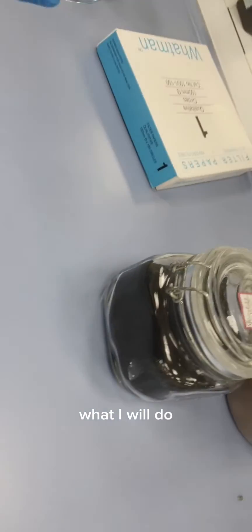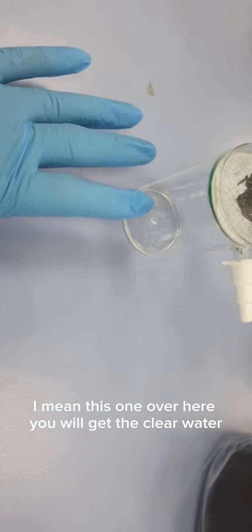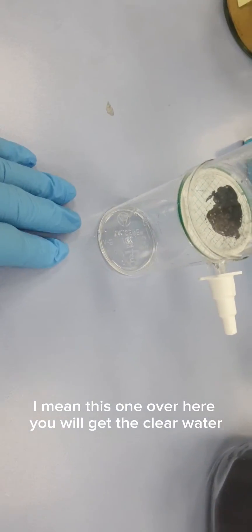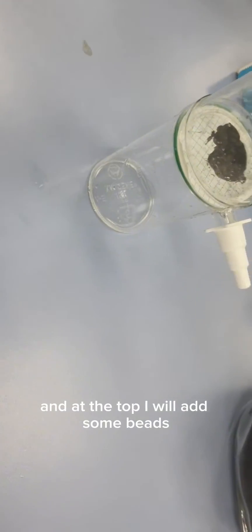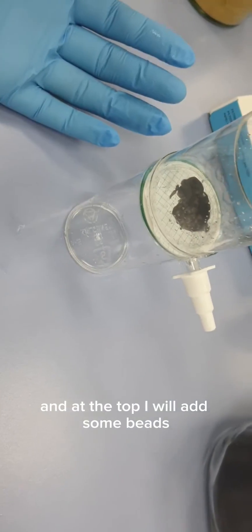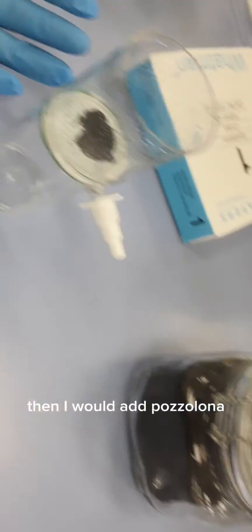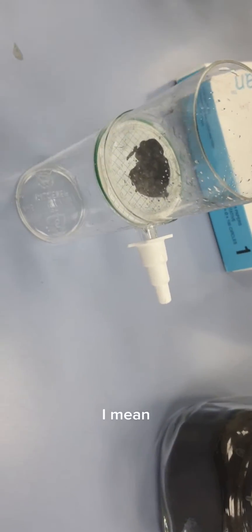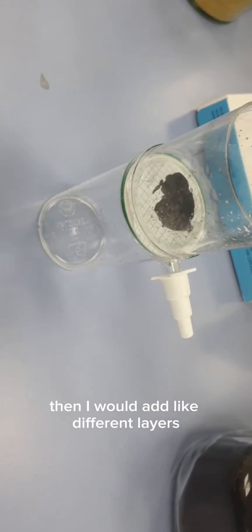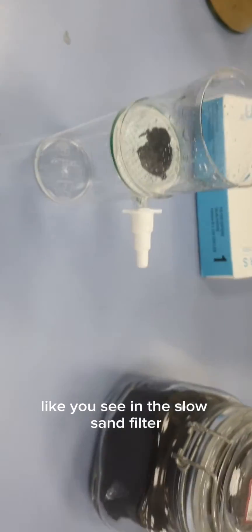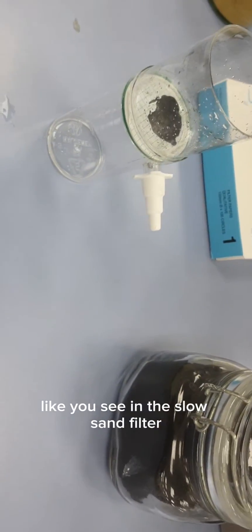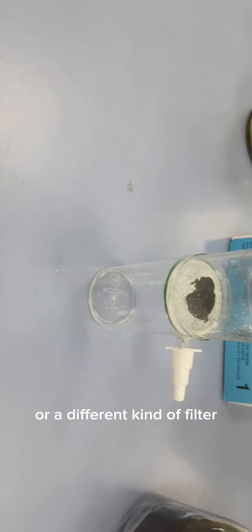At the top I will add some beads as support, then I would add pozzolona, then biochar, then different layers like you see in slow sand filters or different filtration systems.